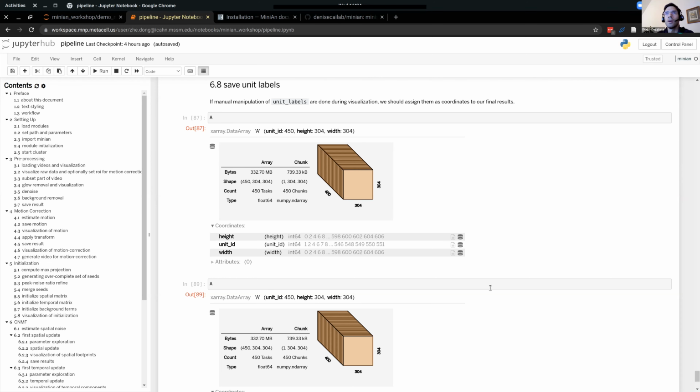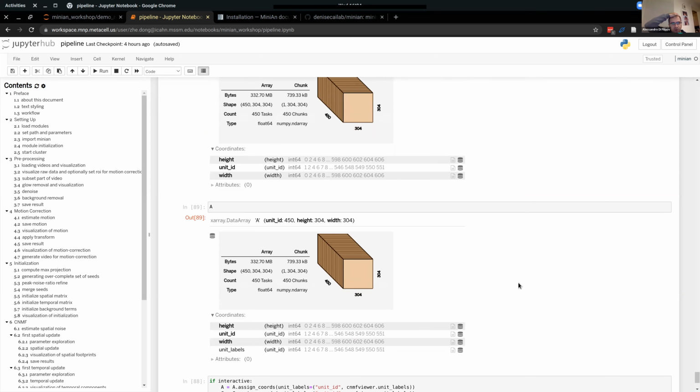Gotcha. Thanks, man. This version, I'm probably using a previous version because I don't have the contents, and I noticed that several other things were changing. So this is the new version that I can get from GitHub, correct? Yes. Cool. So one thing that I tried that may be helpful for other people is that I tried to use this notebook with Papermill. Yes, that's how I used to do the batch processing.